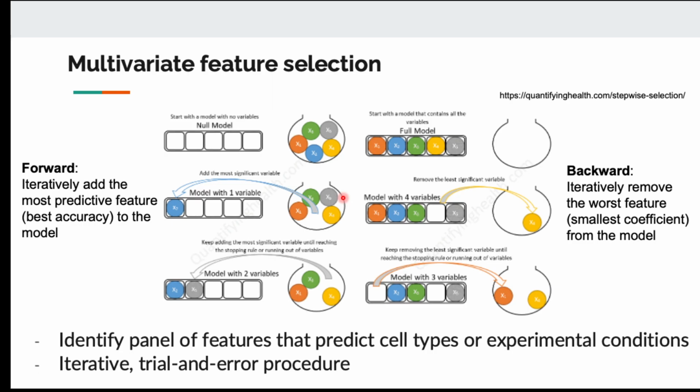Okay, so for the next section, we're going to try to understand how exactly we can detect the individual nucleus, how we can identify the individual cells. This will fall into a field called image processing. It's similar to how you edit your picture.